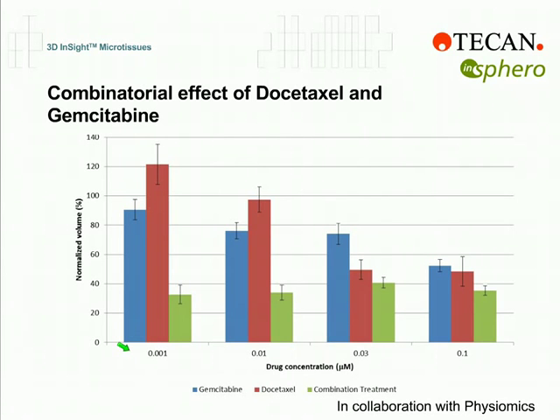The single compound concentrations do not have any severe impact on growth. However, in combination, as shown here with the green bar, there is a clear decrease in size as compared to the controls. And the higher the concentrations are getting, the lesser the combinatorial drug effect is apparent.